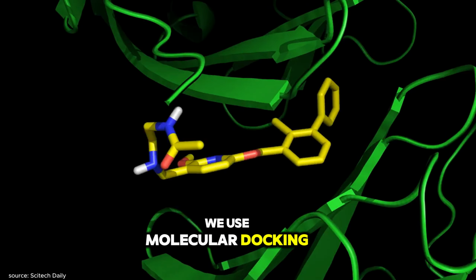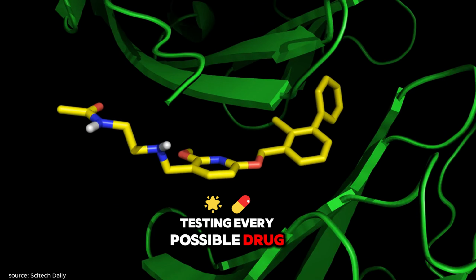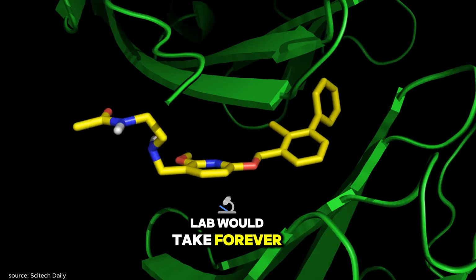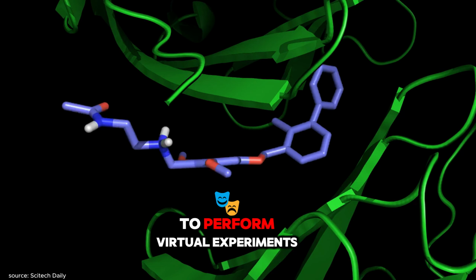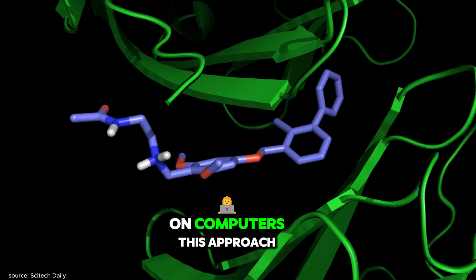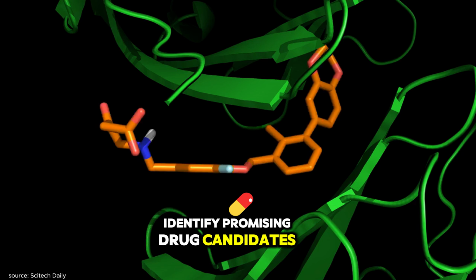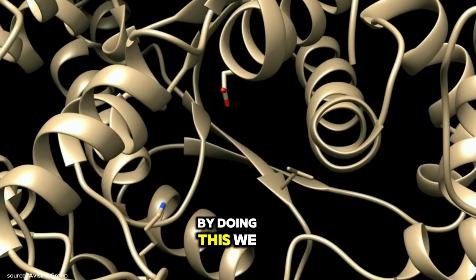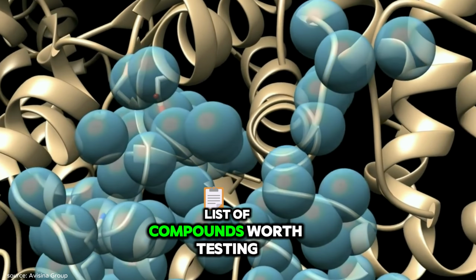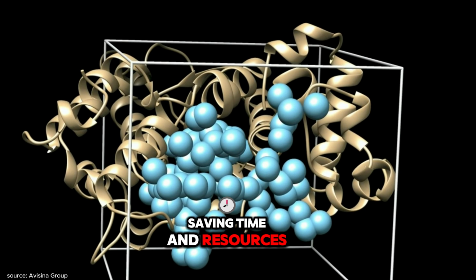We use molecular docking to speed up drug discovery and development. Testing every possible drug compound in a real lab would take forever and cost a fortune. Instead, scientists use molecular docking to perform virtual experiments on computers. This approach allows researchers to quickly identify promising drug candidates by predicting how well they bind to their target proteins. By doing this, we can narrow down the list of compounds worth testing in real-life experiments, saving time and resources.